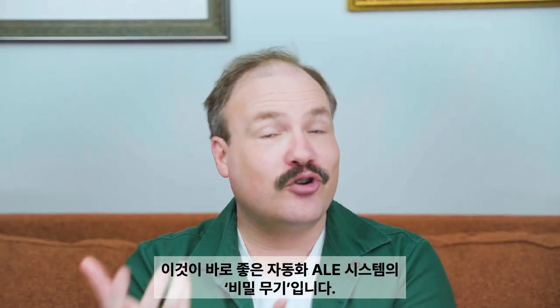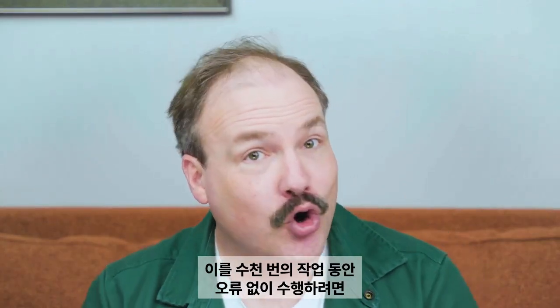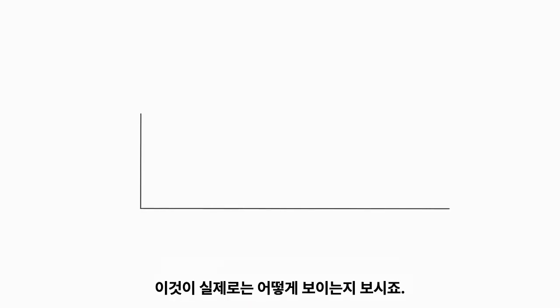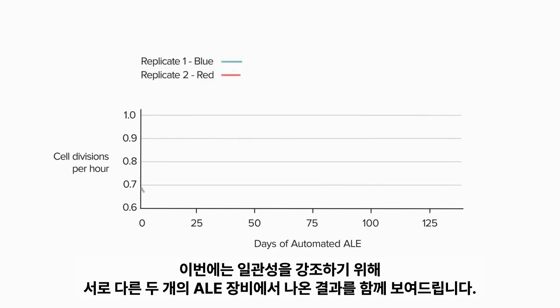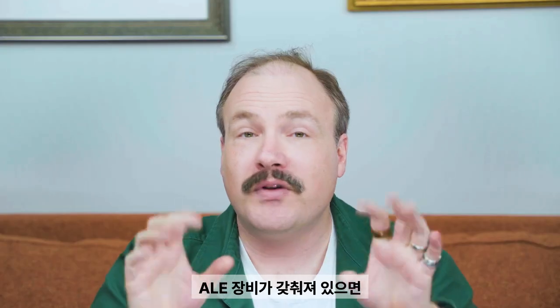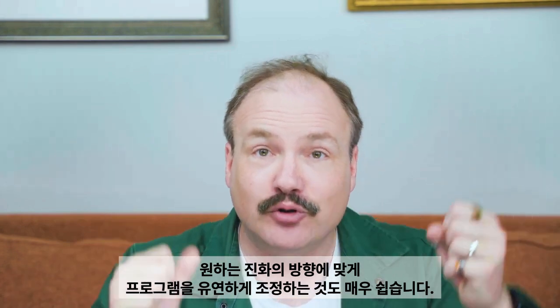This is the secret sauce for a good automated ALE system. Moving liquids around is simple. Doing it with no errors for 1,000 operations requires many subtle optimizations that took years to perfect. Here's what that looks like in practice. New microbes, new feedstock. This time, we're showing results from 2 different ALE devices to highlight the consistency. Evolution is remarkably steady for about 100 days. Then the growth rate levels off. No further mutations appear to change the fitness. The population stabilizes.